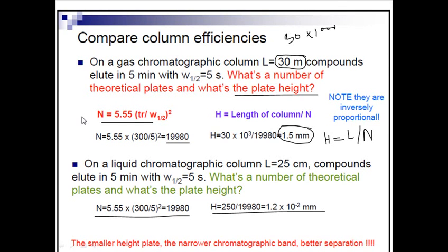So what is the necessity of using these huge mathematical formulas? Nothing but to compare different kinds of separation machines. We have different separation tools, different separation chambers, different separation columns. If we need to compare different columns, we can use these formulas to derive different results, and with those results we can say that this column is better than that column.